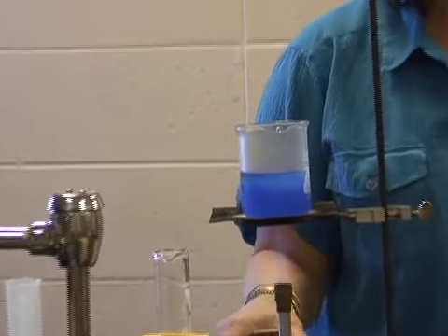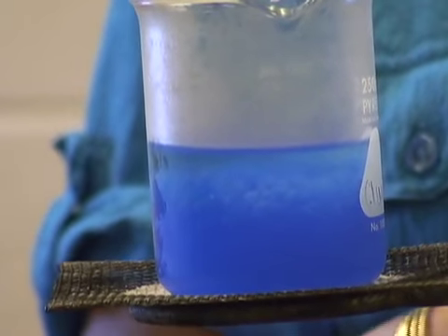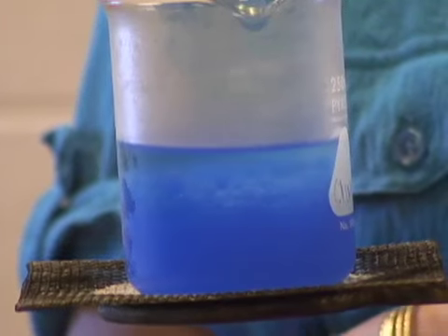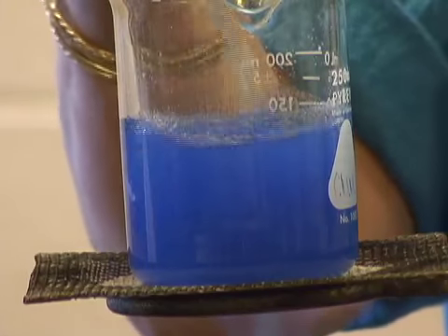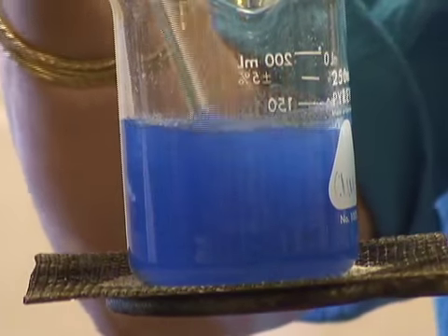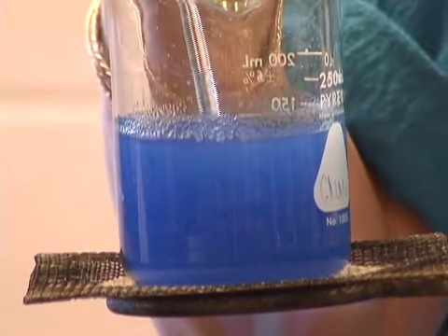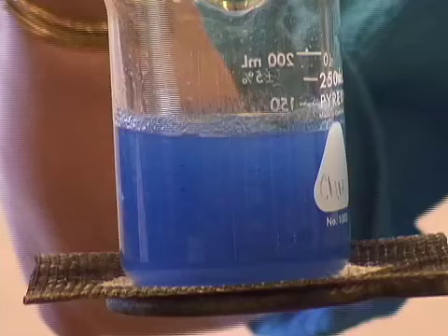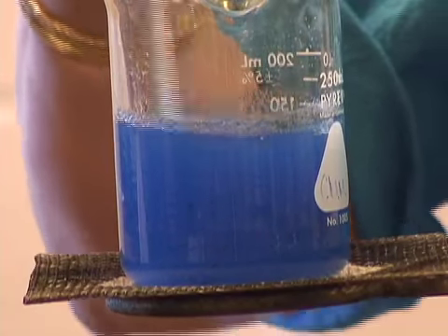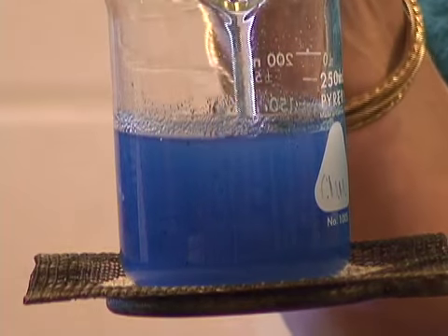until it gets right to the boiling point, and you'll see what's going to happen to the solution. Well, here we are looking at the beaker, and we can see that it is turning. There are black particles coming about there, and the copper 2 oxide is black, so all of this copper 2 hydroxide will be changing to copper oxide. We can see those black particles forming in such a beautiful royal blue, and then it turns all black.